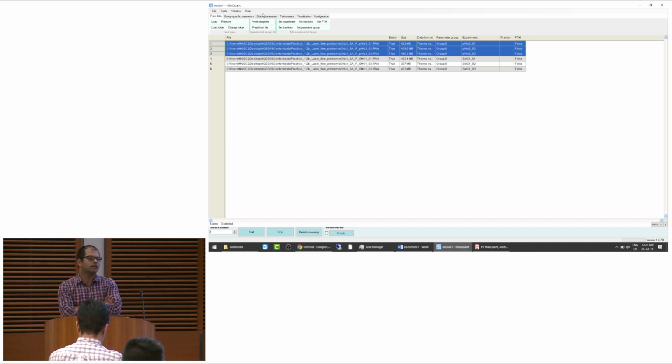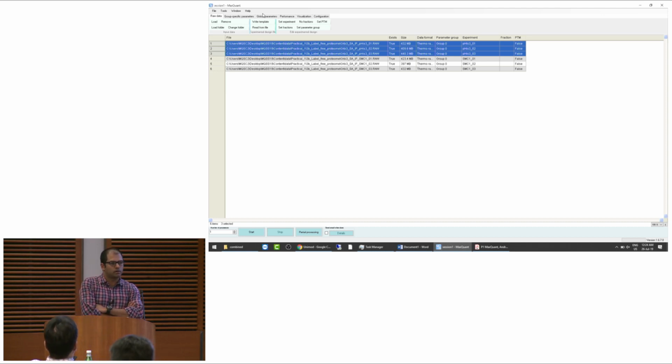This is more for a SILAC, but that requantify option, when should that be used? What considerations should be made when doing a SILAC experiment? So when you have extreme changes and one of the channels is not found, then the ratio is not reported, right? So if you're only looking at the ratio, then you miss that because it's an extreme change, but you miss it when you look at the ratio column. So in order to avoid that, maybe you can use the requantify option. All right, thank you.